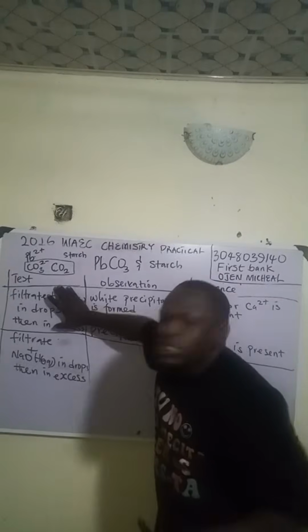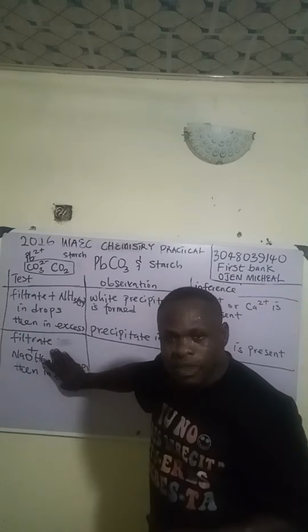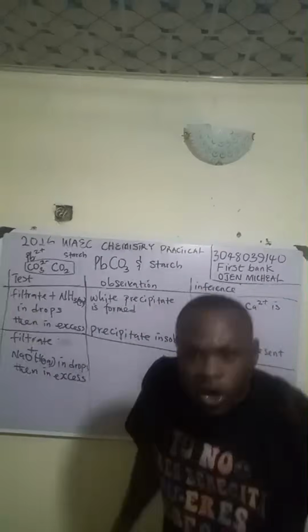It is either you use ammonia or what? Or sodium hydroxide. They will either give you ammonia or sodium hydroxide. So when they give you ammonia, what are you going to observe? If they give you sodium hydroxide, what are you going to observe? So, are you following?